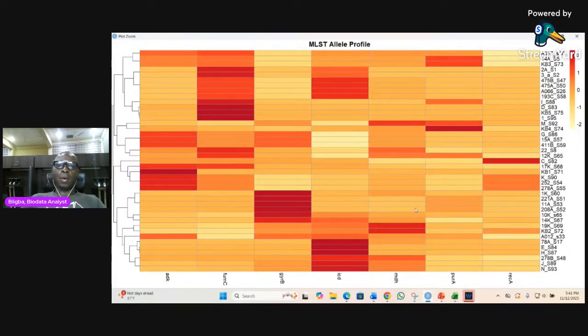Data analysis is about intuition. You look at the way the data looks and you come up with your own way of how to make sense of it. And that's all. I hope you understand how you're able to make sense of it. Another time I will show you another way that you can generate it. But this particular heat map is not showing correlation or collinearity. It's just a comparison of what items are the same and what items are not the same at different blocks or different chunks, meaning in order. So that is why I had to go through the table parts in that order.